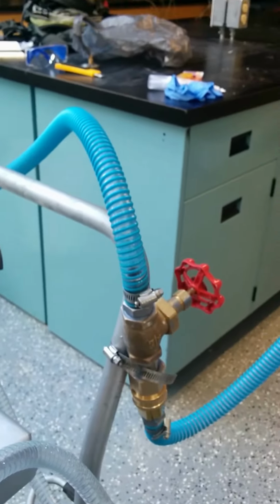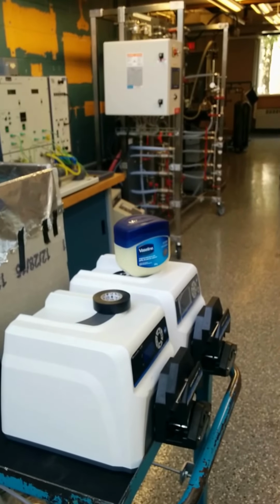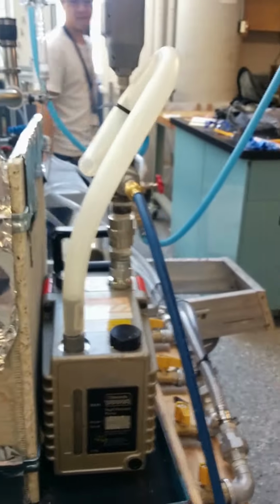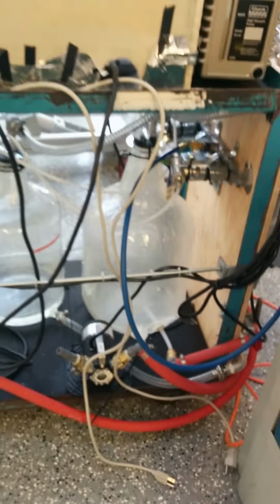That's where we're pulling back in and regulate it. These are our hot plates where we're going to preheat our feed. These are the peristaltic pumps that are going to feed to the hot plates from our feed source. And this is the vacuum pump we're going to use to evacuate these vessels between batches, the A side and the B side. And these are the liquid pumps to pump the liquid from the receivers out to storage vessels.